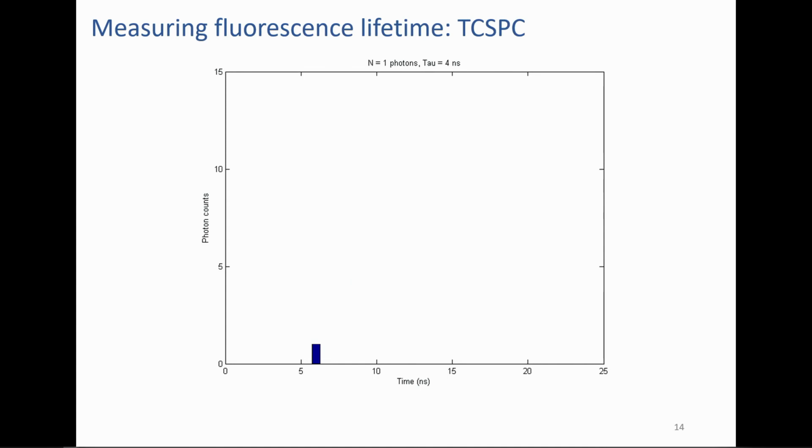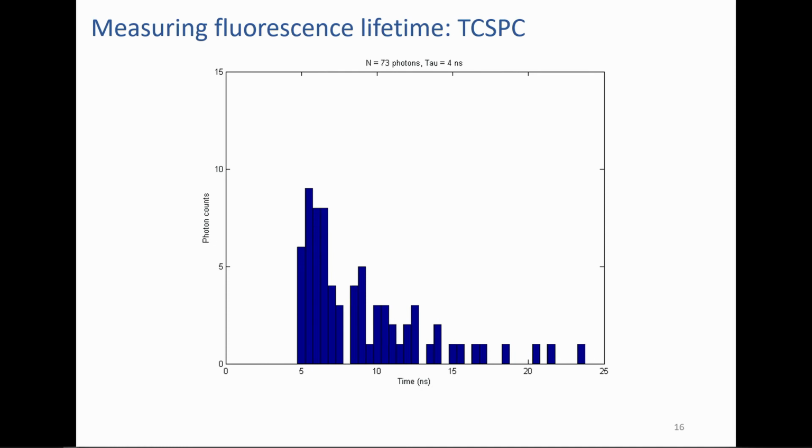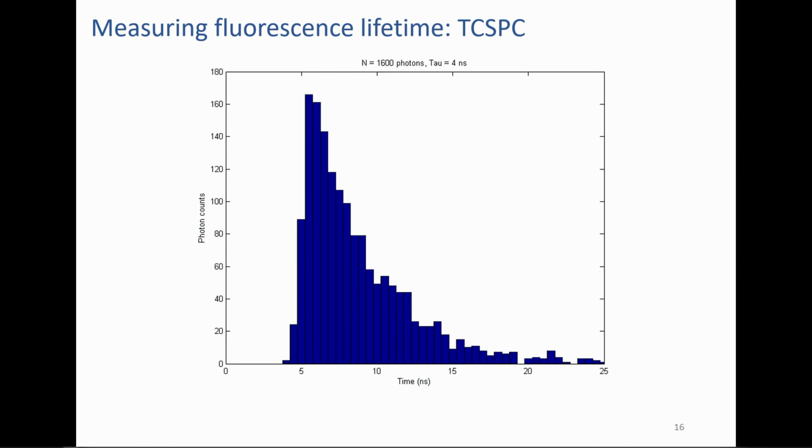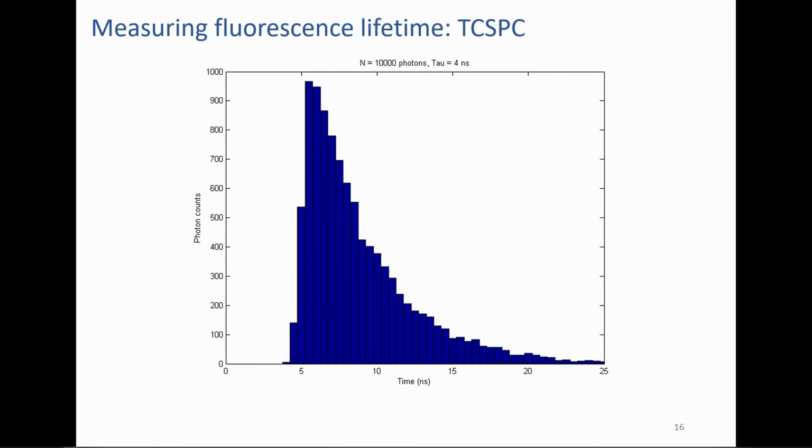I think this may in fact be again Alexa. And so maybe I'll record that first lifetime, and then I do this again, second photon arrives, and the next photons arrive, and I keep going, and I essentially get a histogram. And that histogram, when I bin these things together, will reflect exactly what the fluorescence lifetime decay curve is. Of course, convolved with the instrument response function. And so when you take that out, you can actually get very, very nice lifetime measurements.